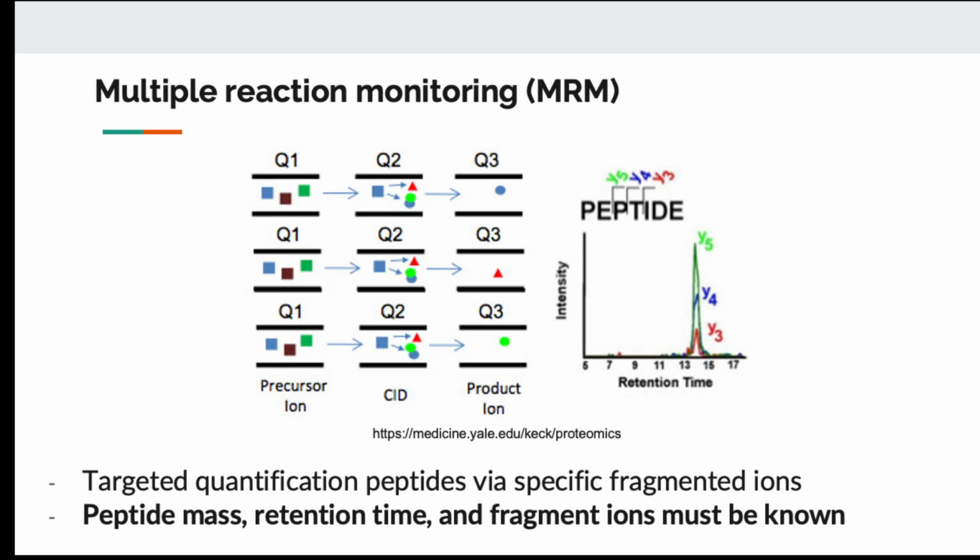So similar to transcriptomics, in transcriptomics we have RNA sequencing, which sequences every RNA. And then we have nanostring and microarray that target certain genes, certain isoforms. For proteomics, it's similar. If you do mass spectrometry as a discovery analysis, you want to identify every protein and peptide. But once you got your biomarker, you know that these are the proteins related to the disease, I want to measure it in my future patient or in my future sample. We want accurate quantification of the protein, of the peptide.